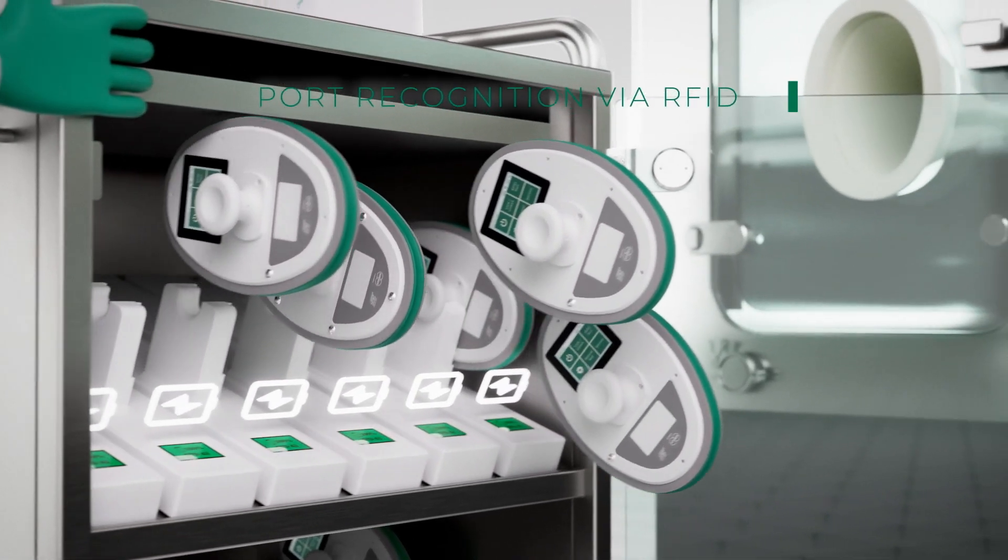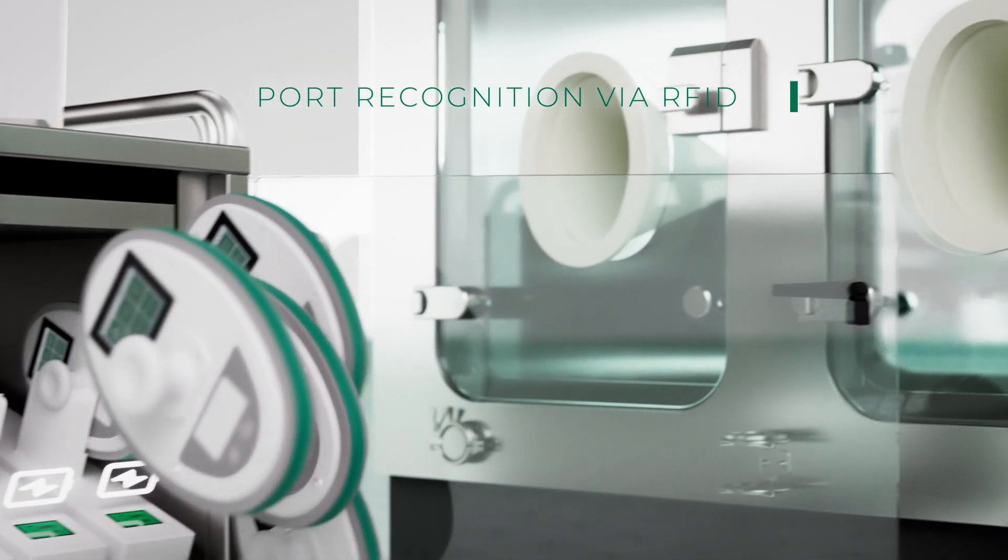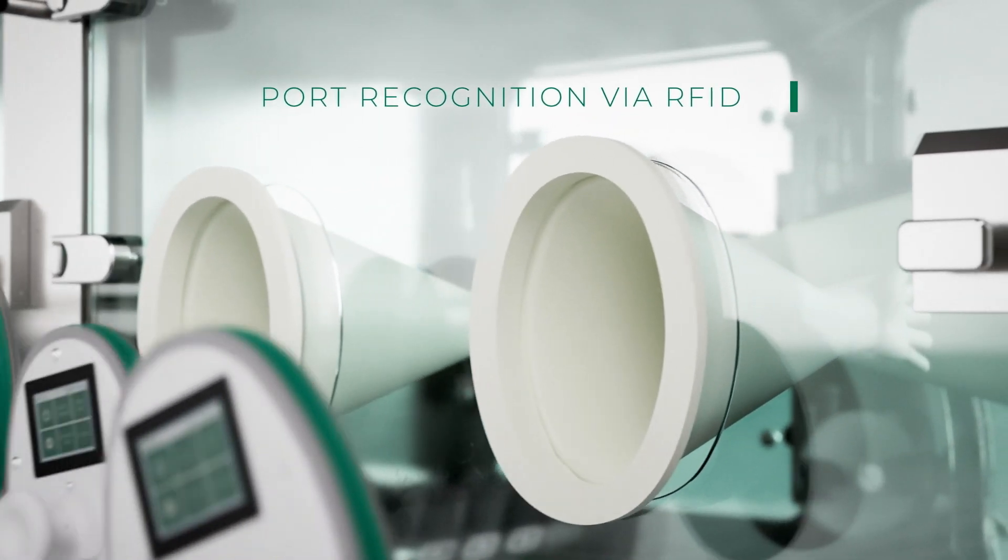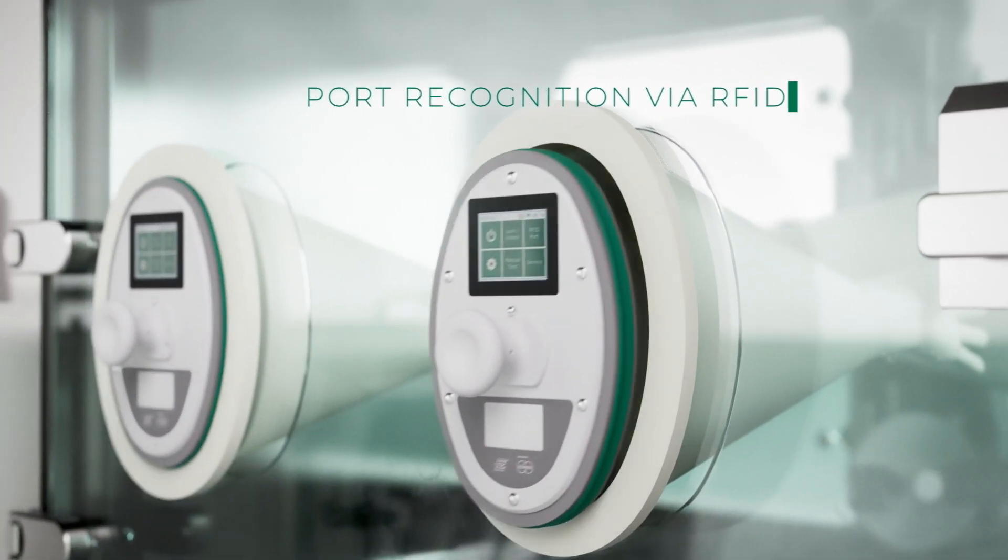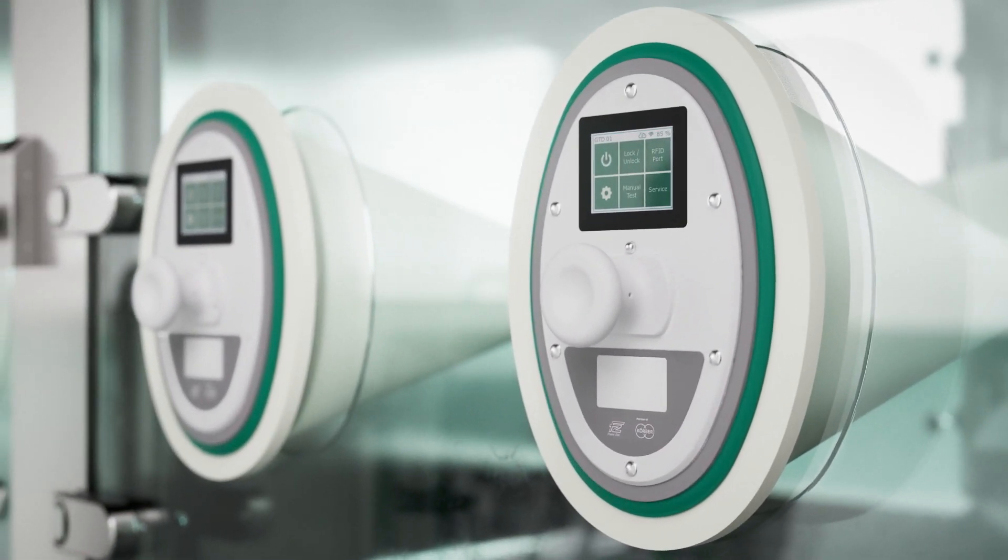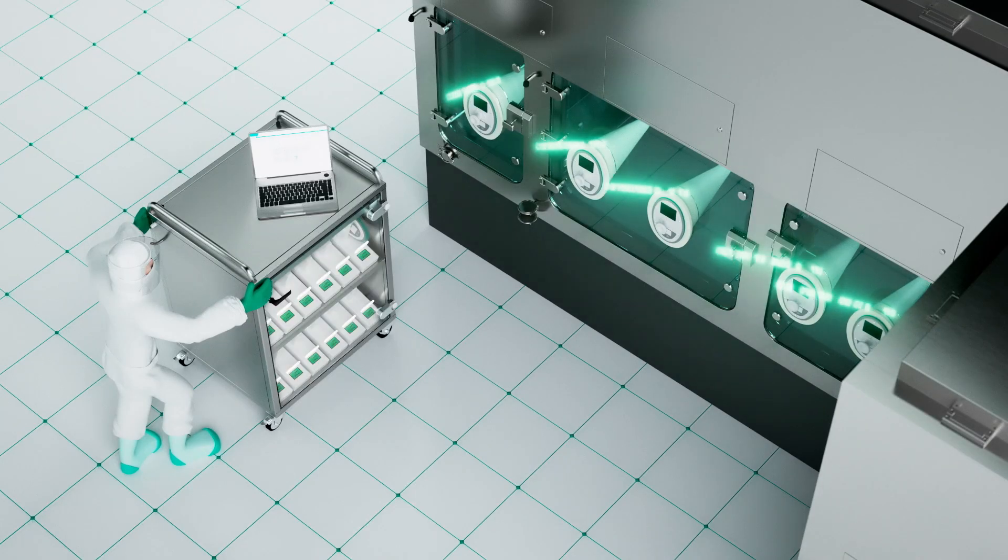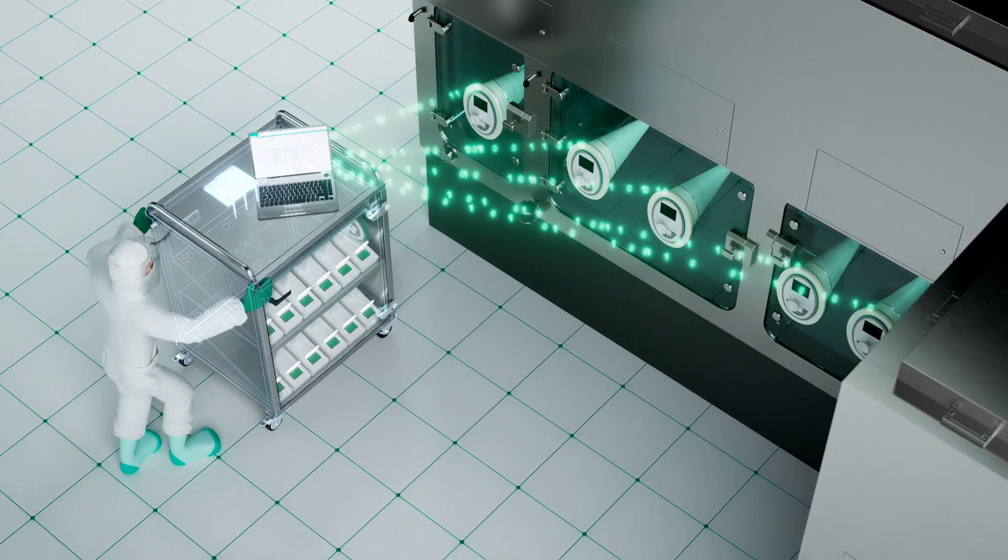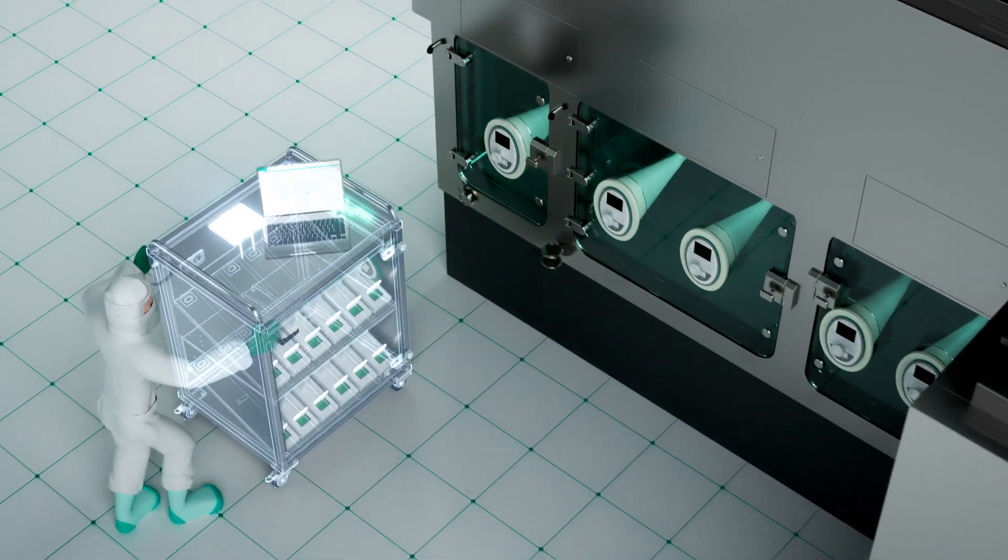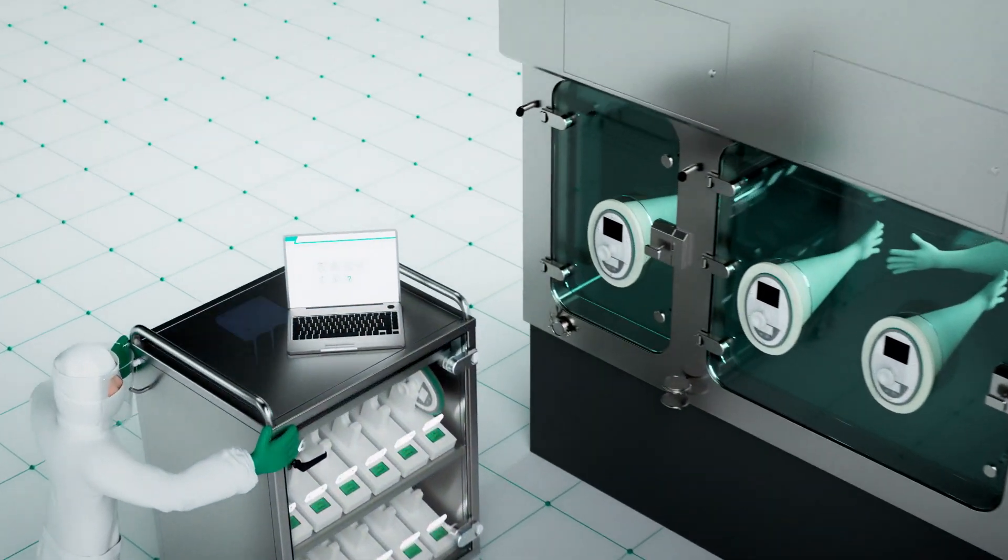For testing, just place the testing disks in the glove port openings and activate them. Everything else will happen automatically. The testing disks communicate with our software and the tests can start.